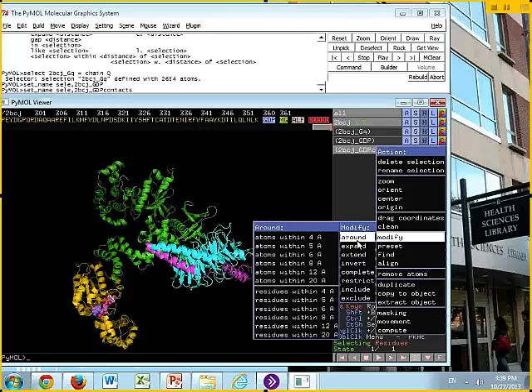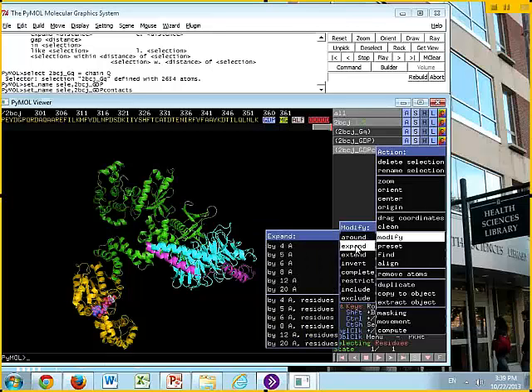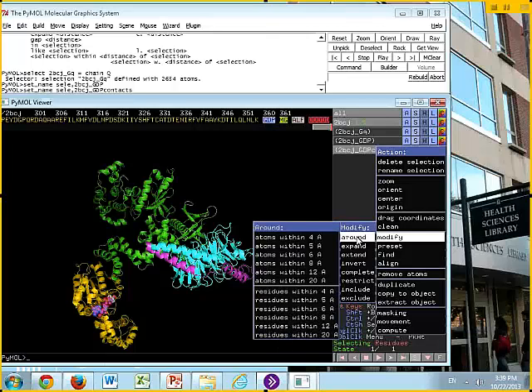We have two main options, Around and Expand. Around means my final selection is not going to include my starting selection. It's only going to be those residues that are around my starting selection. Expand keeps my starting selection. I want you to use the top option, Around, and I want you to come down to the second half, Residues within 4 Angstroms.